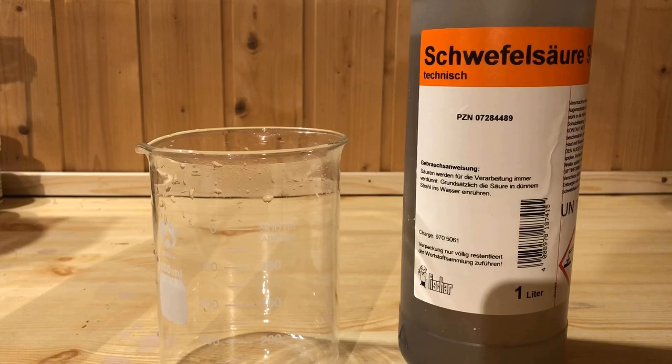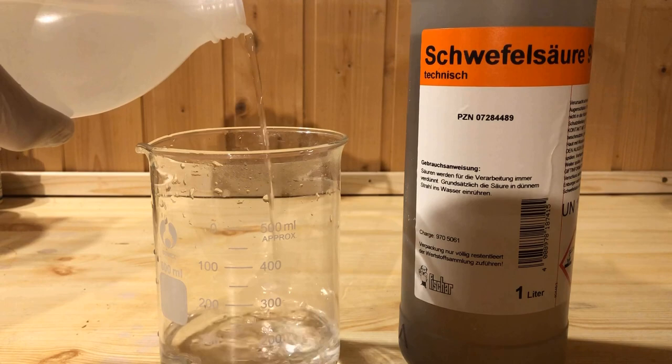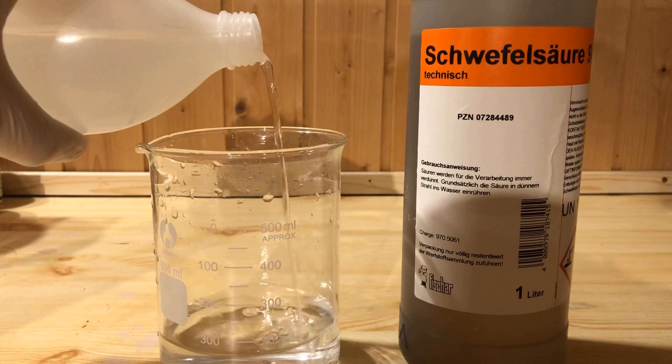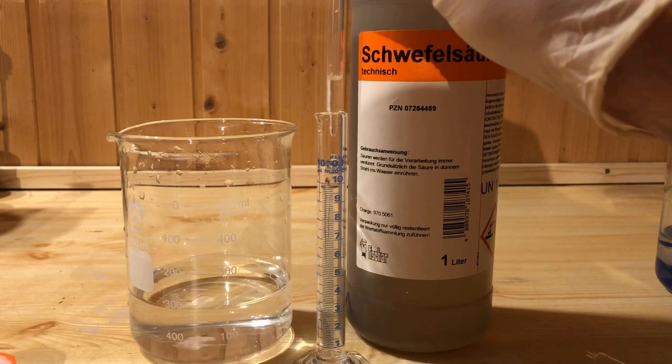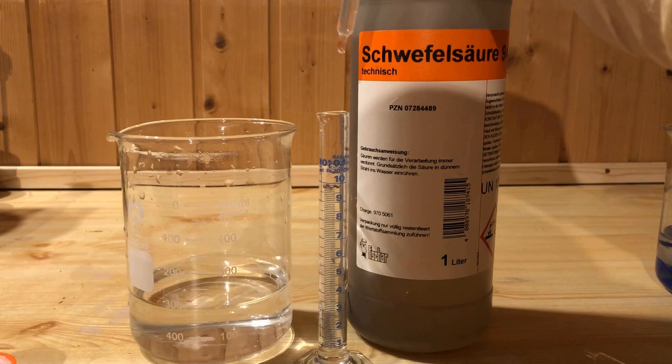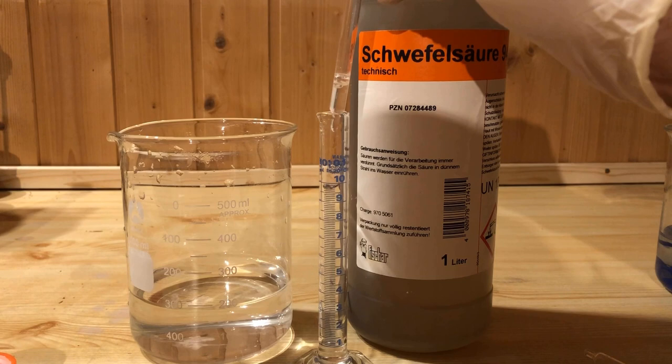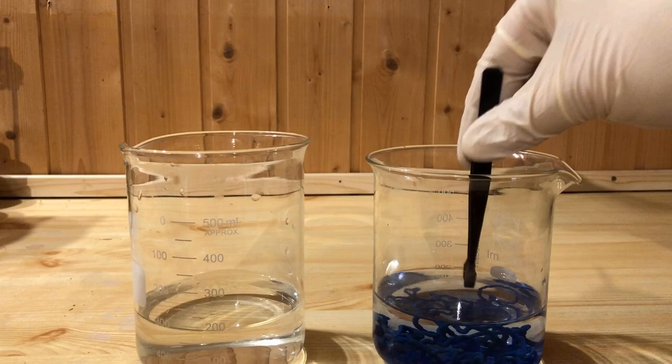In another fresh beaker, 200 ml of distilled water is added. Using a pipette in a graduated cylinder, 20 ml of concentrated sulfuric acid is measured out. After adding the concentrated sulfuric acid to the 200 ml of distilled water, the synthetic silk thread is put in. This is for decoppering and may take a while.